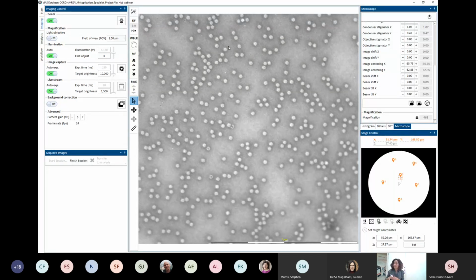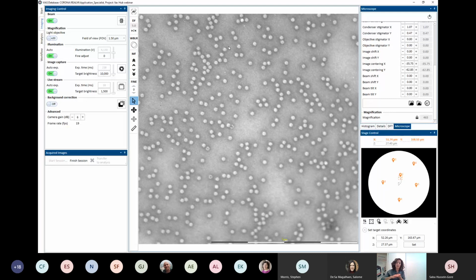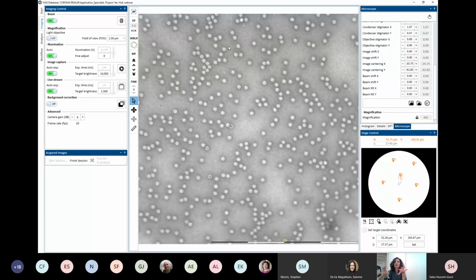When we start the imaging, we always make sure that automatically our beam is spread as much as possible, specifically to avoid the chances of damaging the grid or the sample in the grid square, so you don't have this happening. I hope that answered your question. So it happens just as much with the MiniTEM as with other ones, but by having the beam spread out more, you should hopefully be able to avoid it. Right now, I'm focusing on this one area, and actually uranyl acetate is a stain that can tolerate these things quite well.